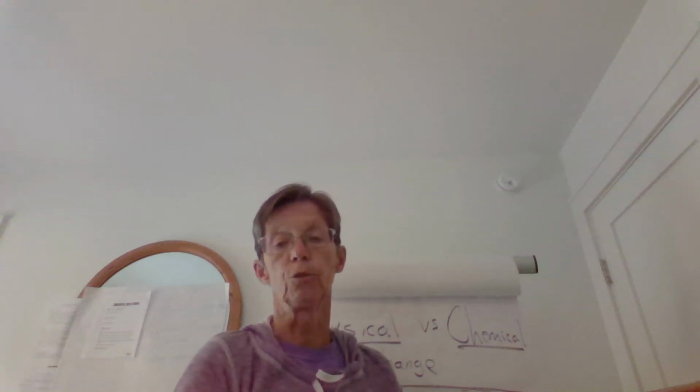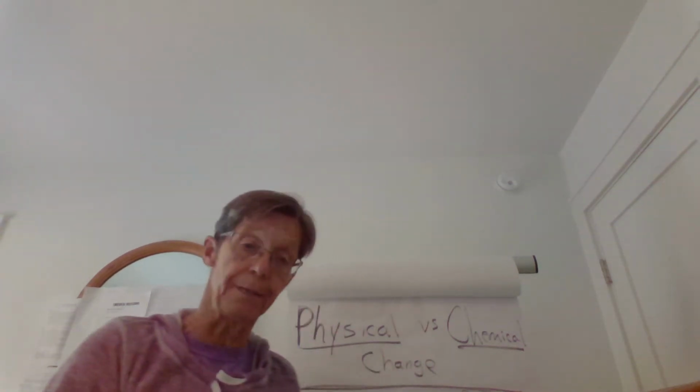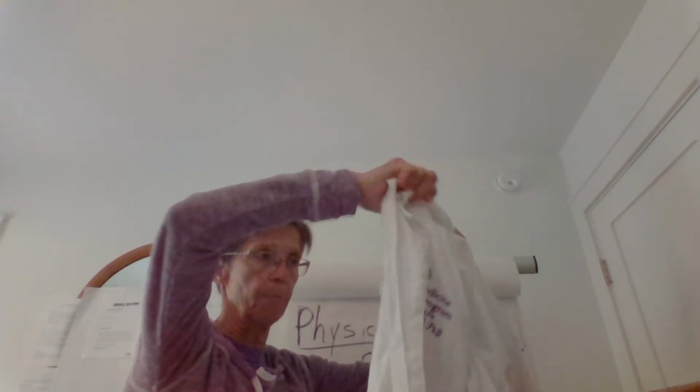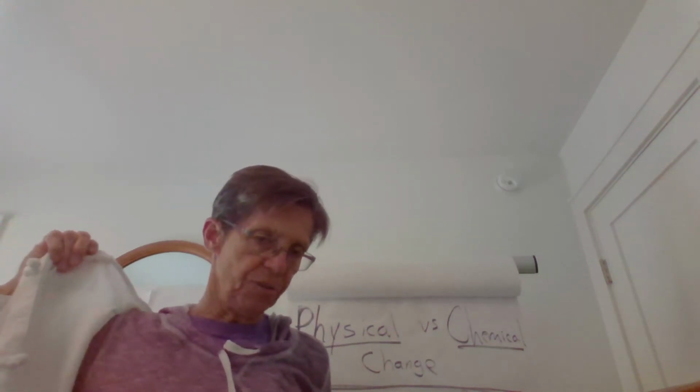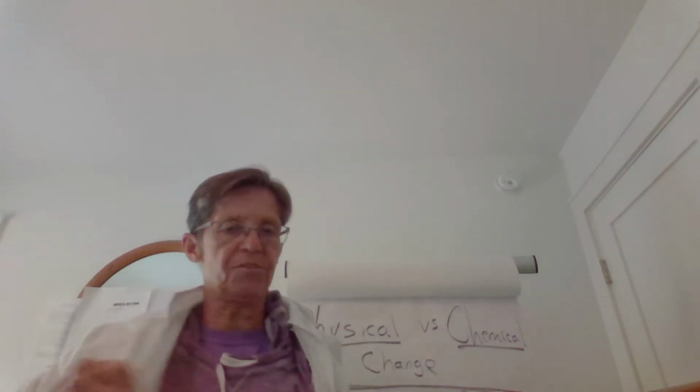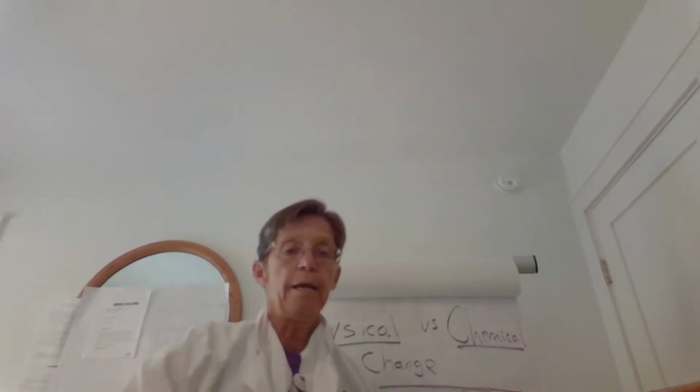Hi, y'all. So some of you missed our lab today, and I'm just going to let you know that I'm getting ready. I'm going to put my lab coat on, and if you missed this, we're going to try to go through it step by step, all right? So I got my official lab coat on, let you know that I'm playing scientist today.